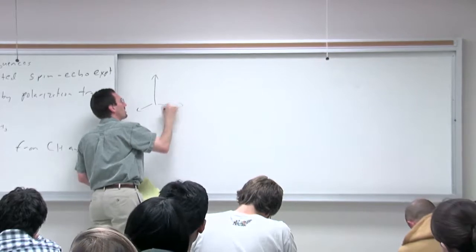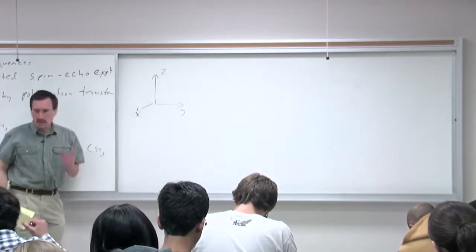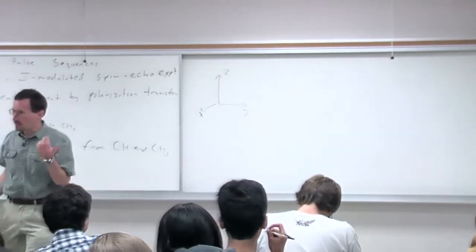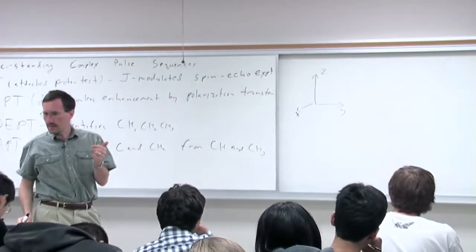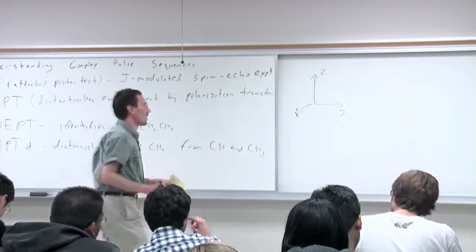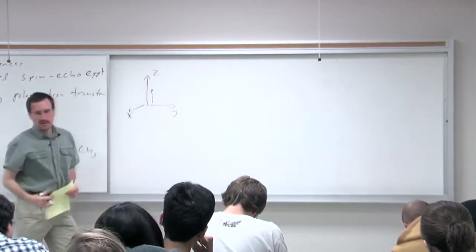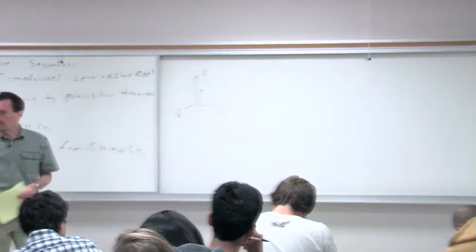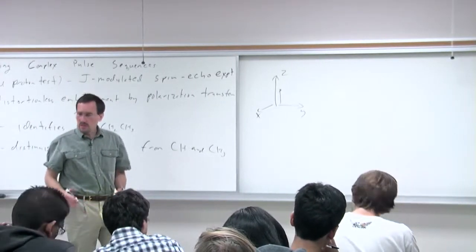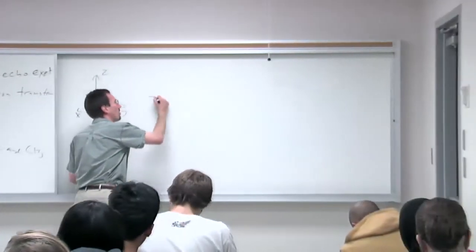when we started to talk about NMR spectroscopy. So remember, you start and you've got this difference in population between the alpha and beta states, and that leads to a net magnetic vector along the z-axis. And remember, that vector is a bunch of vectors that are precessing. And we talked before about the concept of applying a 90-degree pulse.